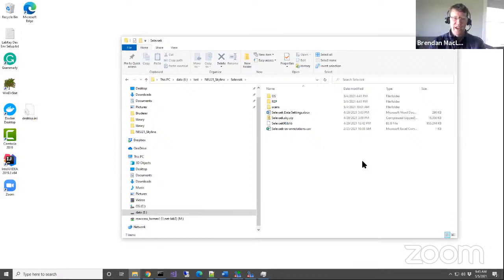And really for these files, switching to mzML often would be very big. So that would be a lot of work to recalibrate, isn't it? It's too bad there's not some Thermo raw file way of recalibrating.